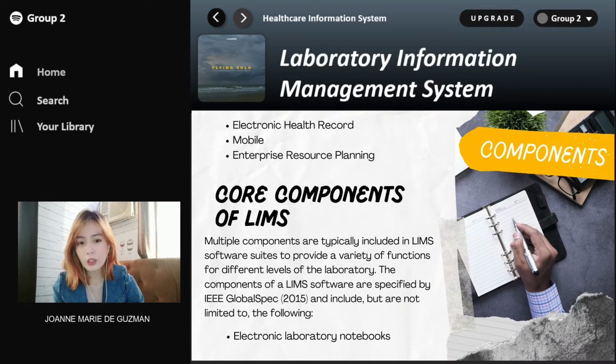EHR, or electronic health records, can store patient details as well as billing information. This characteristic should be considered by a health institution during the acquisition process because it will substantially aid in the management of clinical laboratory operations. In short, the electronic health record stores the patient details as well as the billing information. You should always remember that.